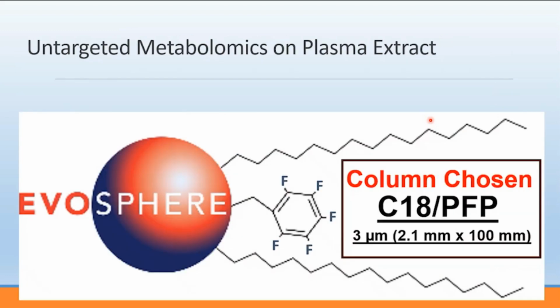And so what I'm going to talk to you about a little bit is a test case when we started looking at a C18 PFP column, 3 micron particle size, monodisperse, with 2.1 millimeter ID and 100 millimeter length. This is the classic phase and length of column that we like to use for metabolomics because it's a good mix between reproducibility, ruggedness, as well as the separation of polar and non-polar analytes in the same given run.